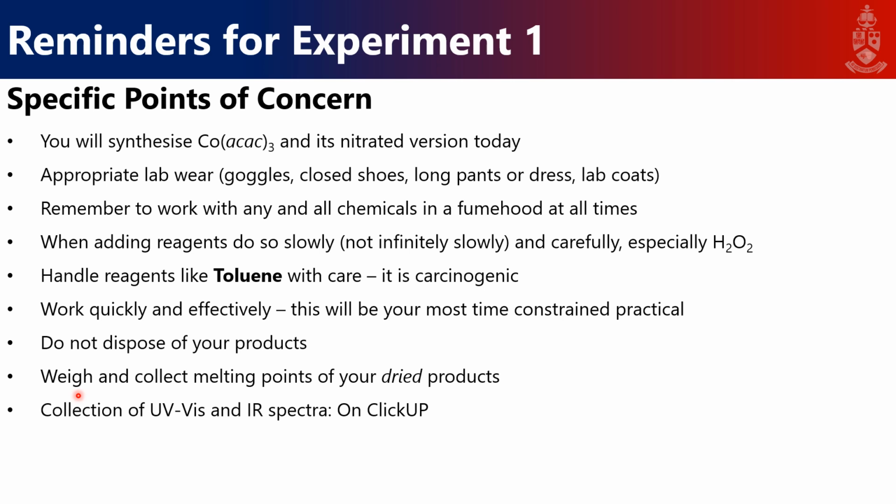You need to weigh the dried product as well as collect the melting points. Why do I say dry? Because it's going to affect your melting point and your masses. So please ensure that you work with your dried products. As for the collection of the UV-vis and IR spectra, there is simply no time for it during the session, so that is provided to you on ClickUp, where you can obtain it.